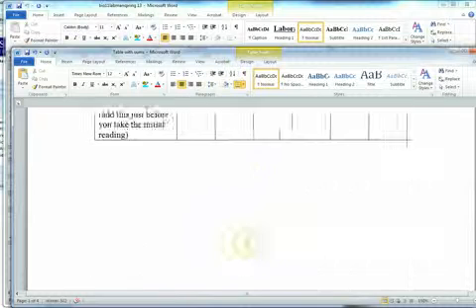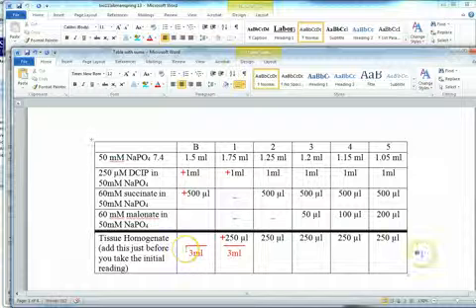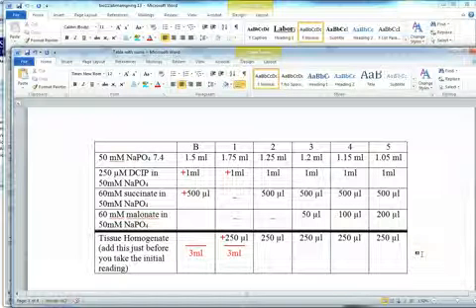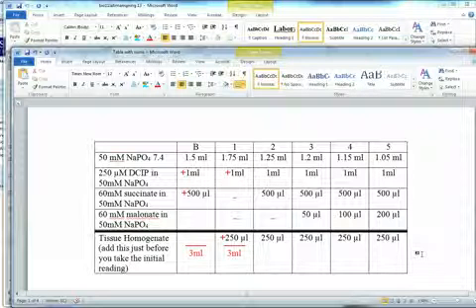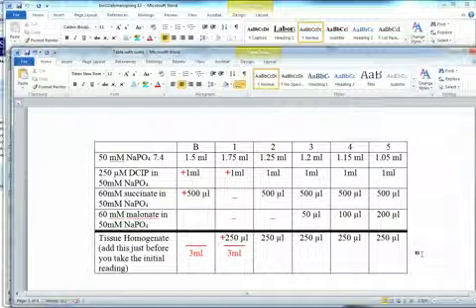3 ml, there we go, 3 ml. We did them in a total volume of 3 ml, and all the way across, it keeps equaling 3 ml, because that's the volume that fits in the cuvettes, that fits in the spectrophotometers that we have in Bio 11.